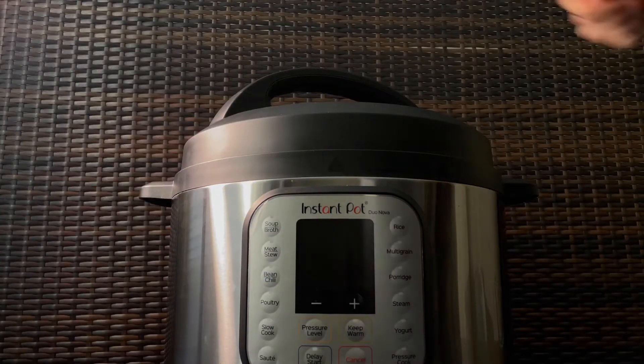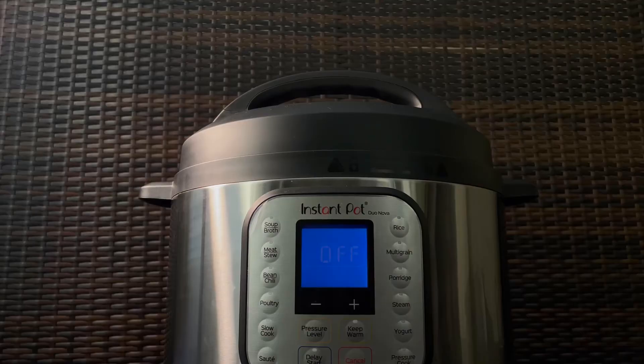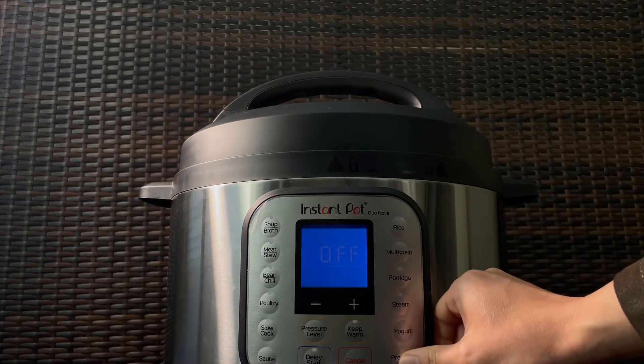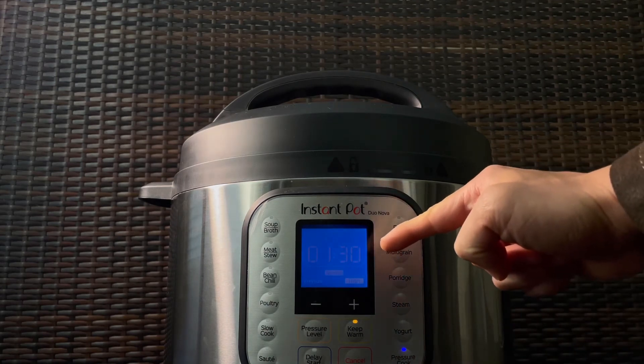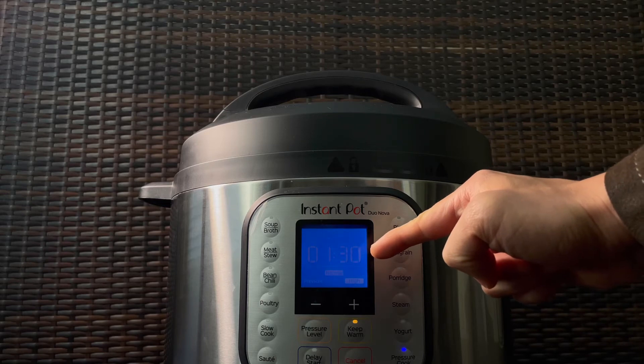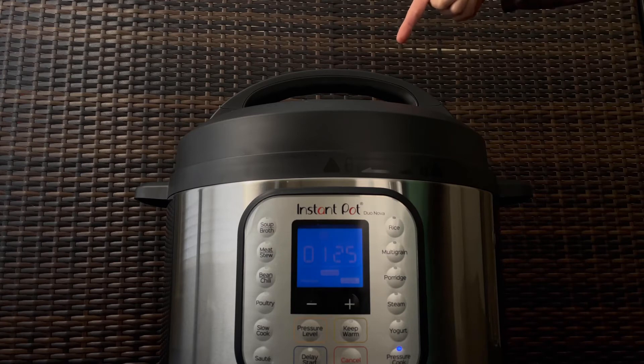Seal your Instant Pot and set the timer to one hour and 30 minutes. As a side note, make sure the steam release valve is set to the sealing position.